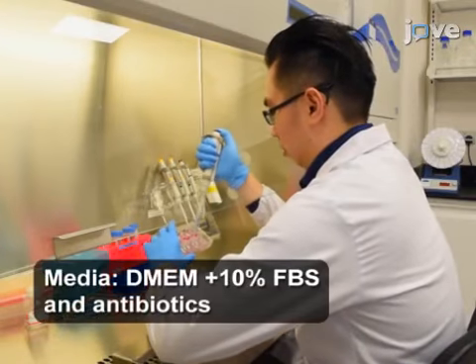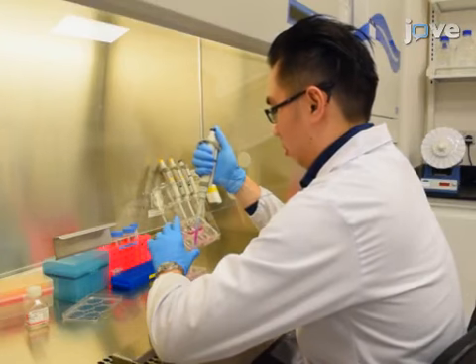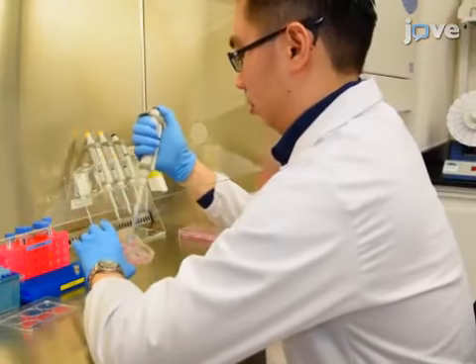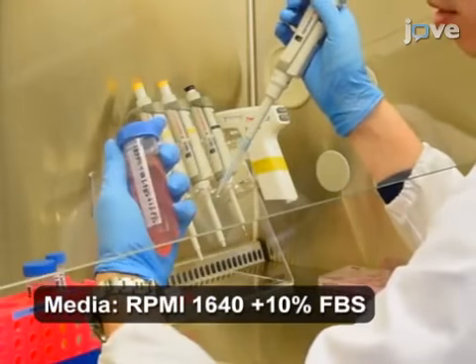Culture mesenchymal stem cells to greater than 80% confluency on a 6-well plate prior to labeling the cells with the nanoparticles. Similarly, culture THP1 cells to a density of 1 million cells per milliliter.